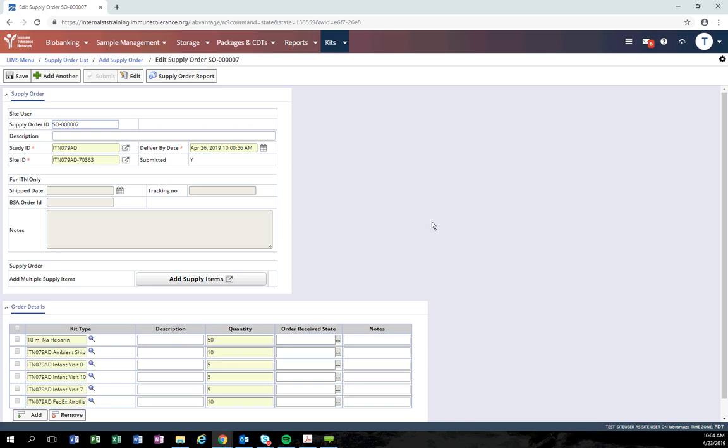After the order has been received by the ITN, we will enter in the ship date, tracking number, and internal BSA order ID for that shipment.